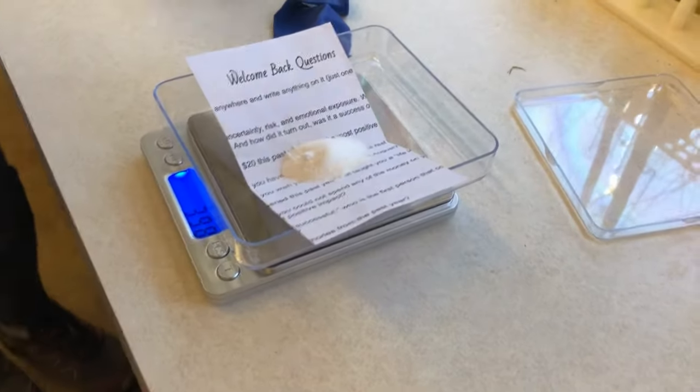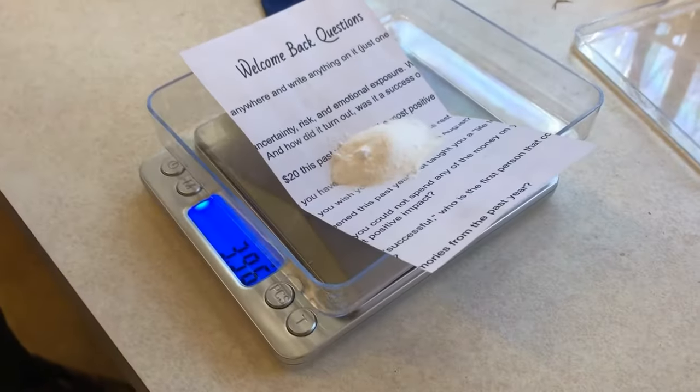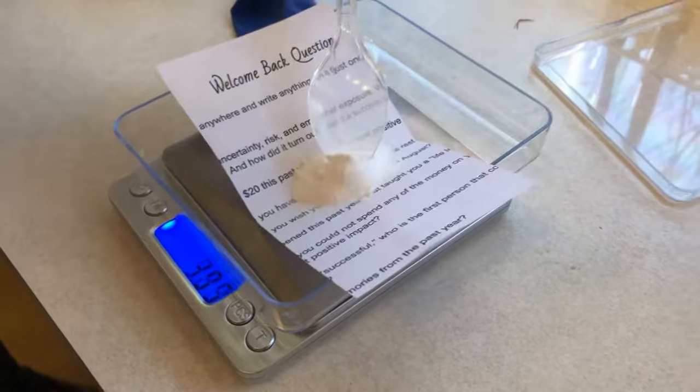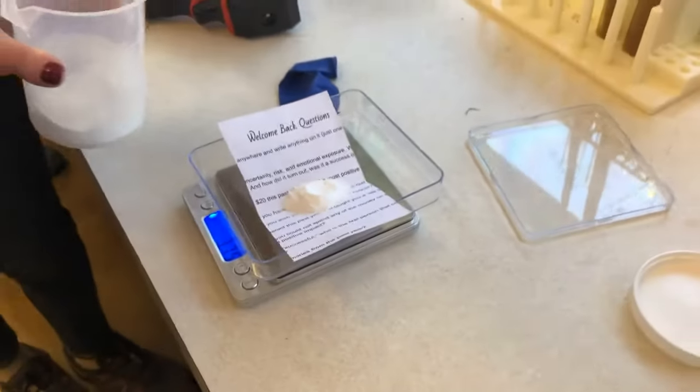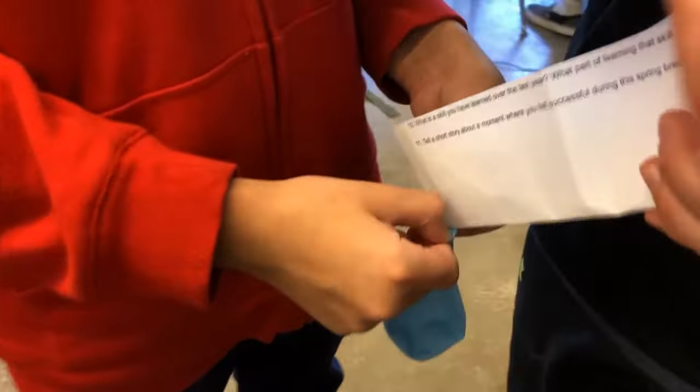They use this piece of paper to measure out 3.0 grams of baking soda. You can see the scale adjusted just a little bit so they can get that 3.0 grams. Then they use that paper to transfer the baking soda into the balloon.